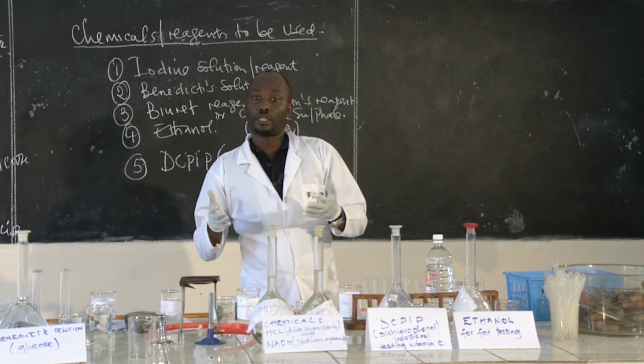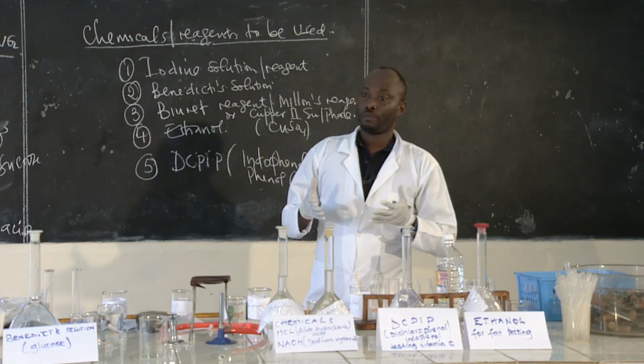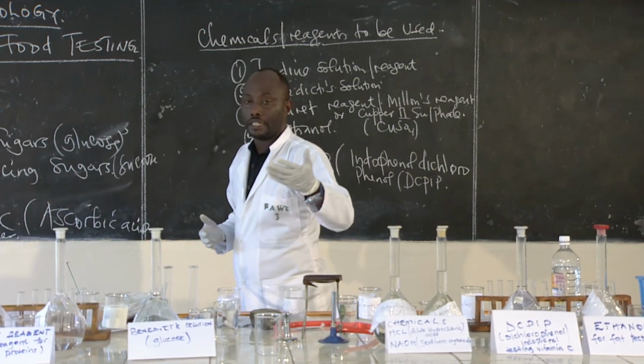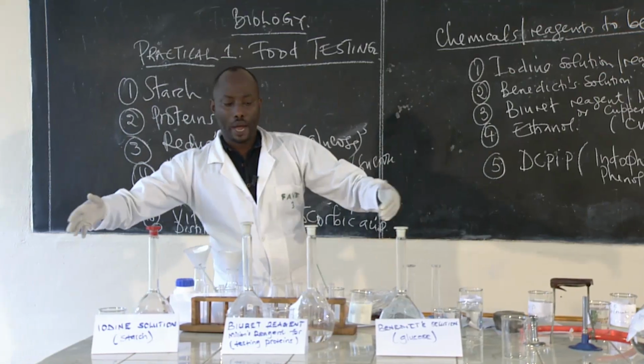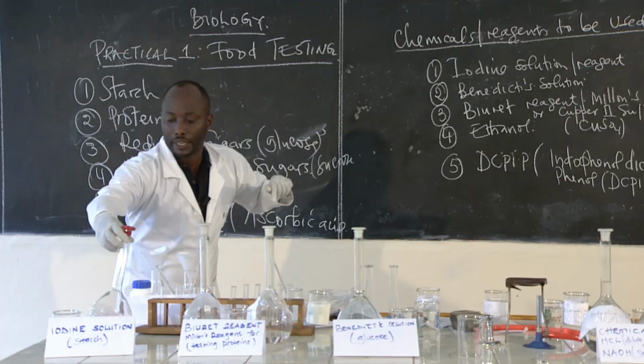I use distilled water acting as a control experiment. A control experiment is an experiment that shows results in a negative way, not in a positive way. All right? So I have some chemicals in front of me: the brown one, the blue one, the colorless one.